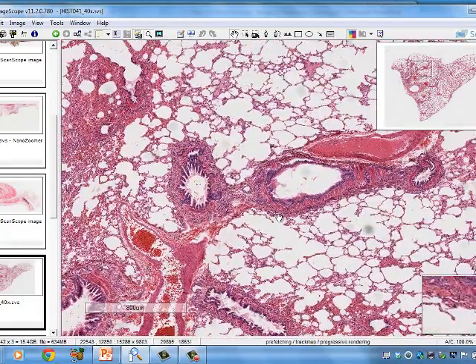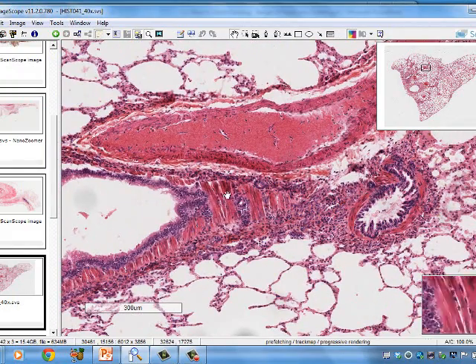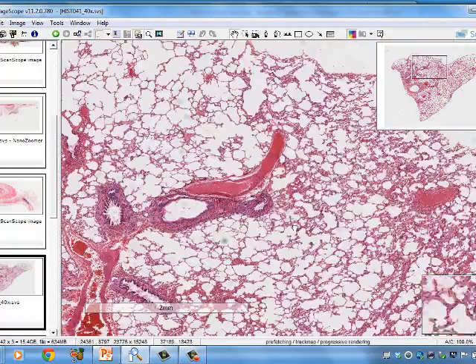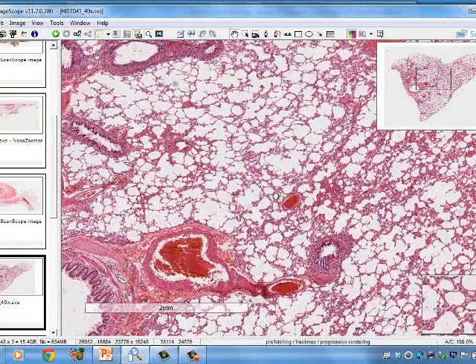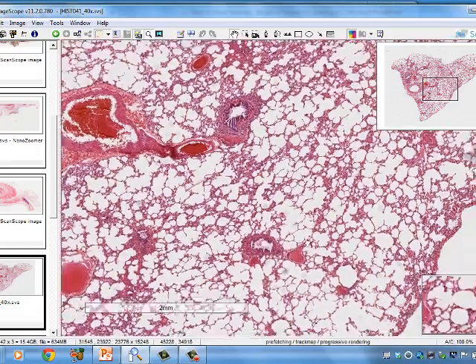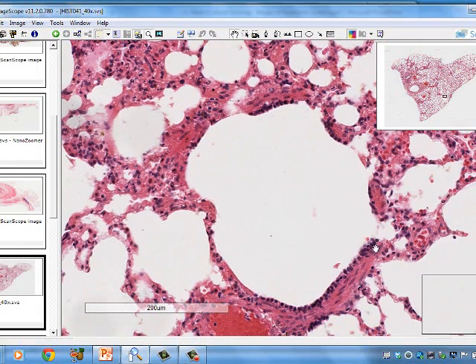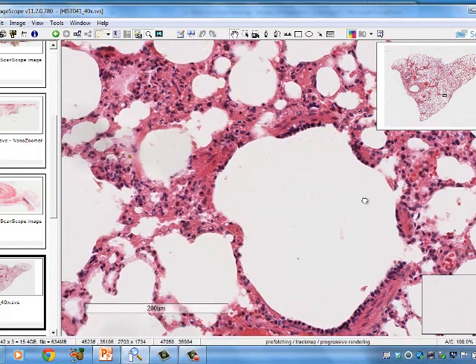And then the bronchioles no longer have the cartilage. You have terminal bronchioles. You can see the smooth muscle that's around that bronchiole. And then finally we have respiratory bronchioles. See if I can find one of these that opens out. This is a respiratory bronchiole right here, where you see some bronchioles and the smooth muscle still on the wall, but it's outpocketing to the alveoli too.